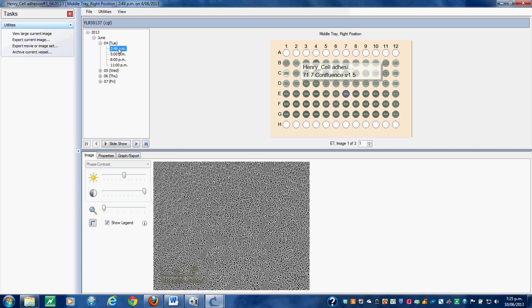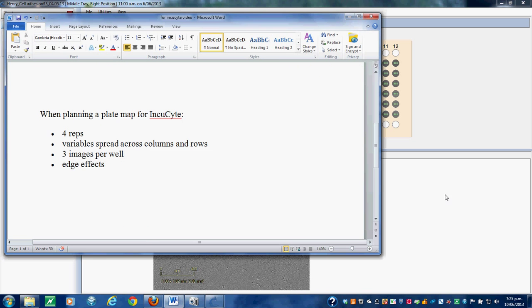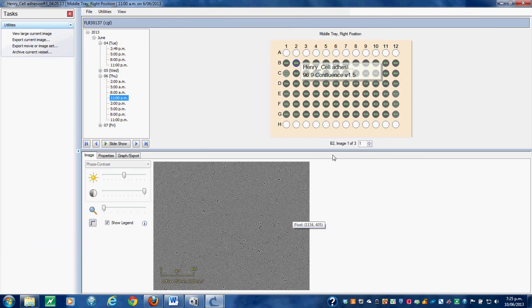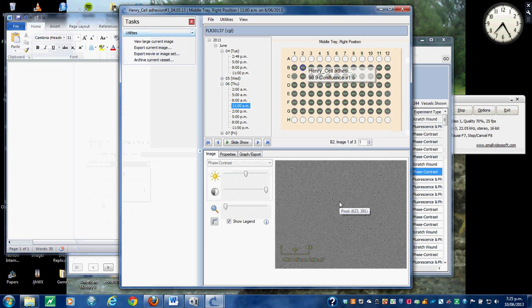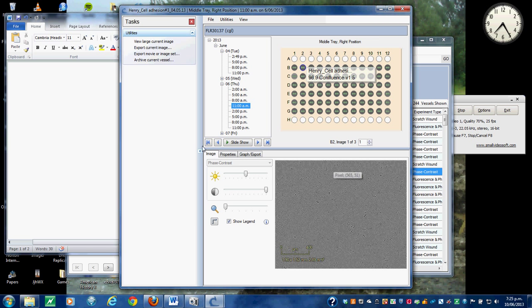Over here you've got the time, and here, if I wanted to export this, I could right click this, drag it, drop it, or I can export as a movie.